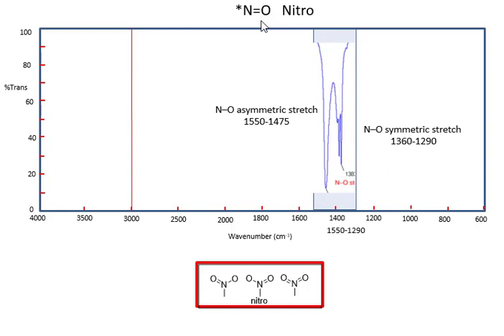An analogous group is the nitro group, N double bond O stretch. If you actually look at the Lewis structure, there's a double bond between one of the O's and a single, as we talked about. That double bond can appear over here, or we can think about it as each one having a bond and a half. So it's going to have a little bit of single bond flavor, not fully double bond character. So it's down in this direction, and there's a big double peak from the NO stretch, an asymmetric and symmetric stretch, dominating the spectra around these regions 1550, 1475, and 1360, 1290.